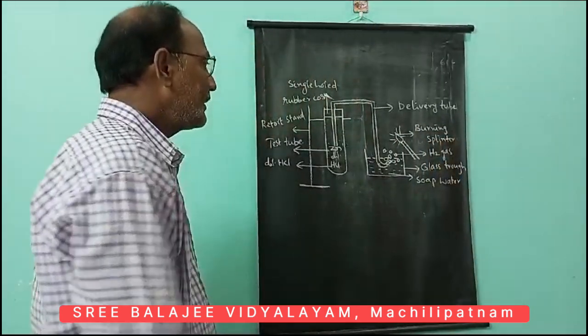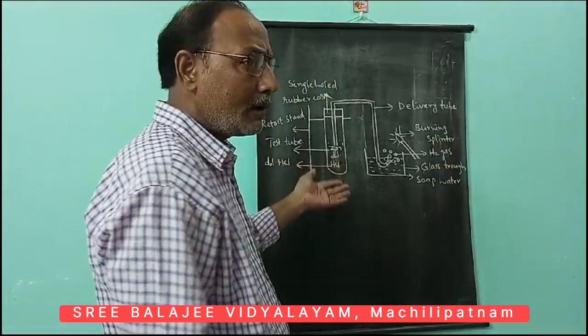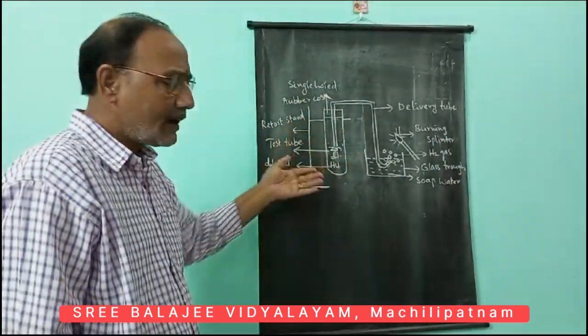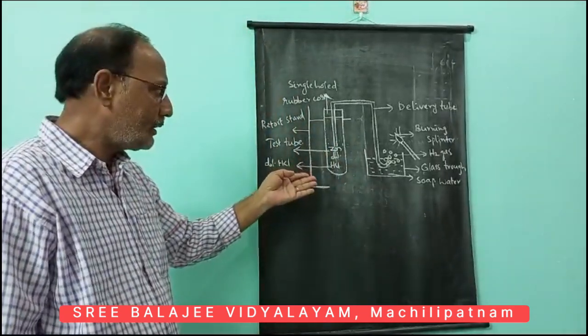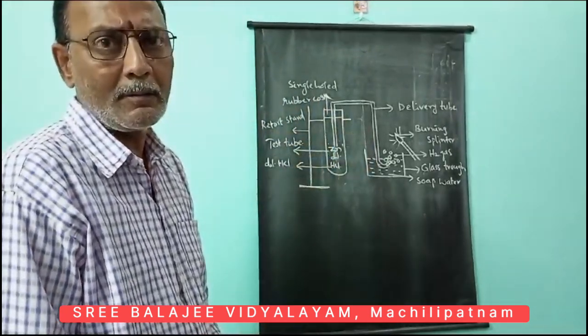So this is the laboratory procedure for the identification of hydrogen gas whenever metals readily combine with the acids here. Not only the acids, with bases also the same result you can get.